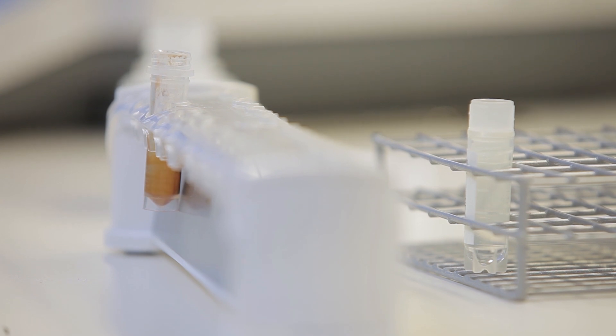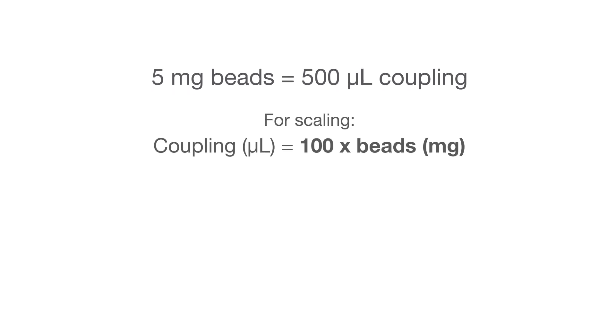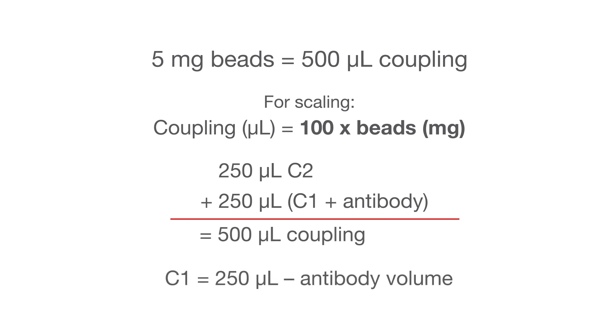All washing steps are done like this. As a guideline, the total coupling volume in microliters is 100 times the amount of beads in milligrams. Half of the coupling volume is C2 buffer, and the remaining half is your antibody solution diluted in C1 buffer. Thus, you'll have consistent coupling conditions independent of your antibody concentration.